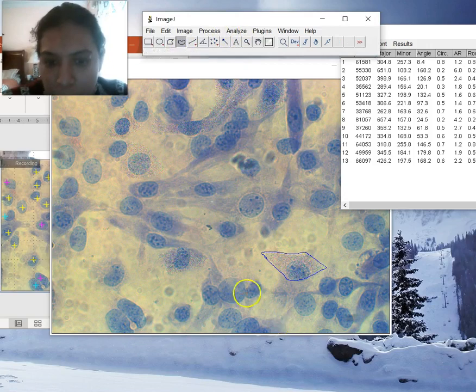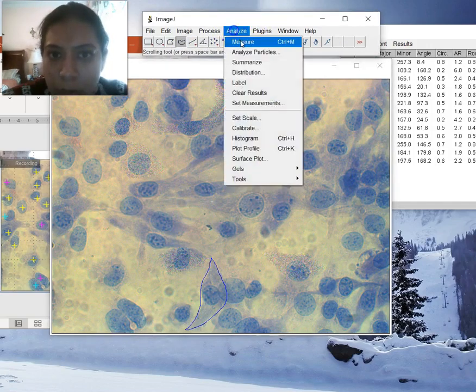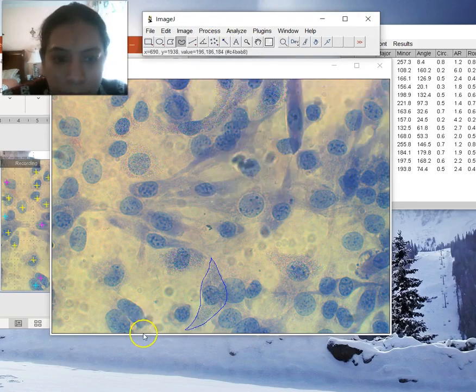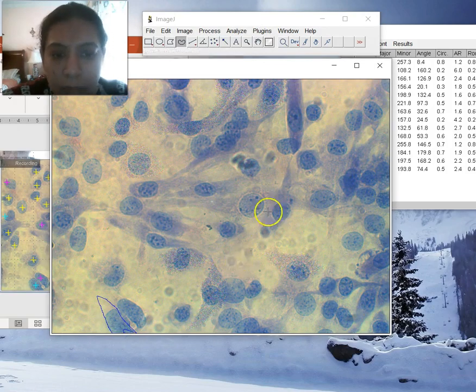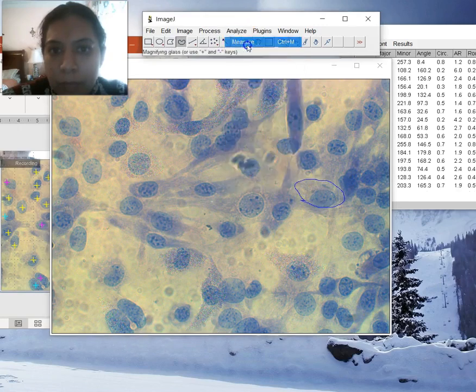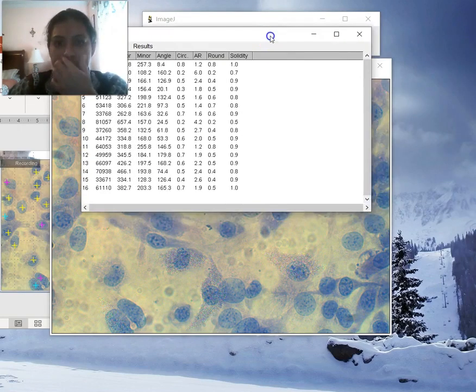So I'm just going to do maybe... So now you have all your numbers.